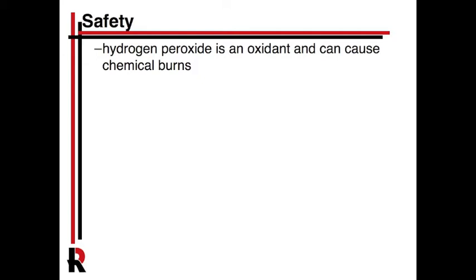Relatively speaking, this is a fairly safe lab. We're using commercial hydrogen peroxide, so it's a mild irritant. I don't want you to get it on you too much, but it's weak enough that it'll wash off with water fairly easily. We are using some sharp sticks. You might poke yourself with a stick. Broken glass, things like that. So use the normal precautions. You're going to need goggles and all those sorts of things because of the environment that you're working in.